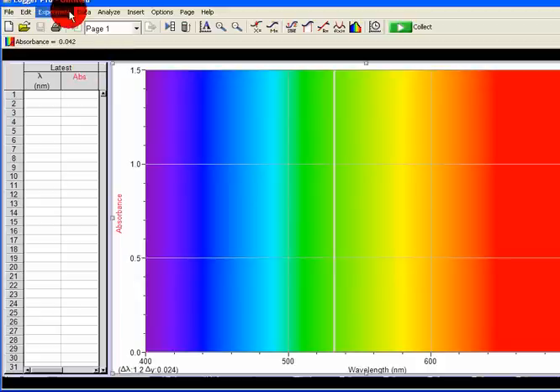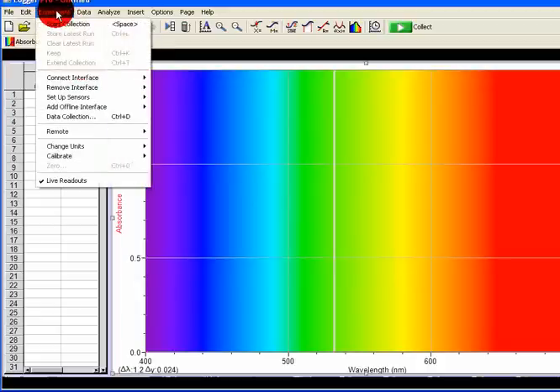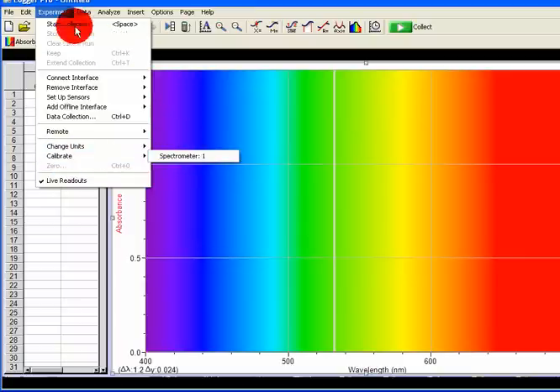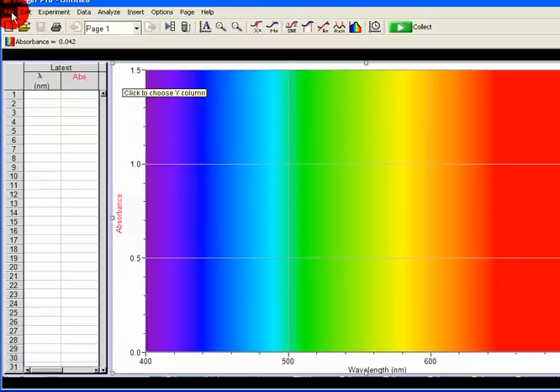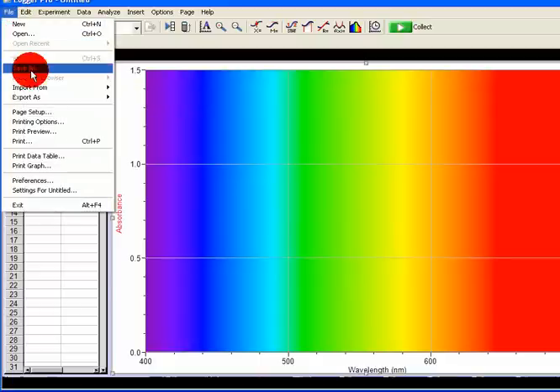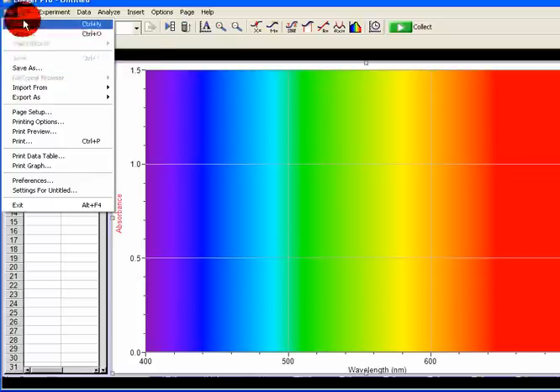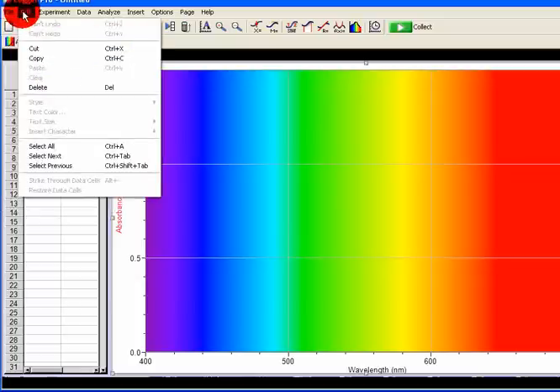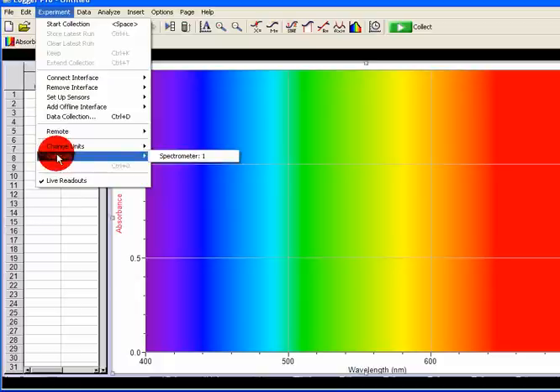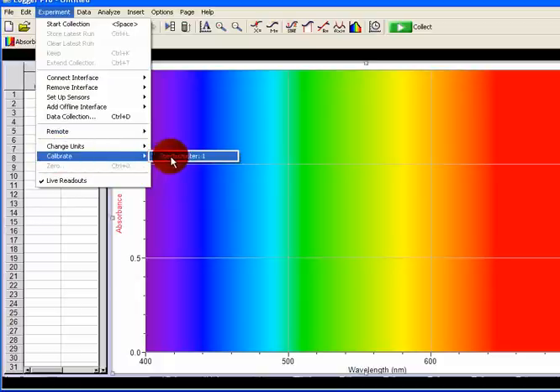So the first thing is we've got to get into Experiment and we've got to Calibrate. Under Calibrate, we've got to calibrate the spectrum — Photometer. Then we have a Start here, and of course this is File. You can have New, Open, and we can save it. We're now going into Experiment, which is important. We must know how to calibrate this machine called spectrophotometer, and we have a data collection.